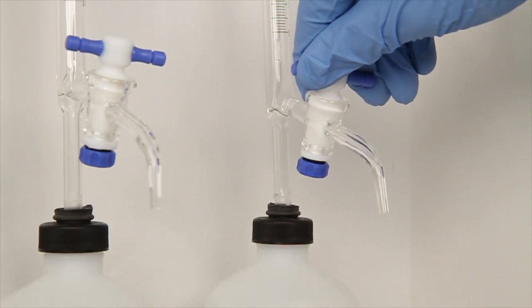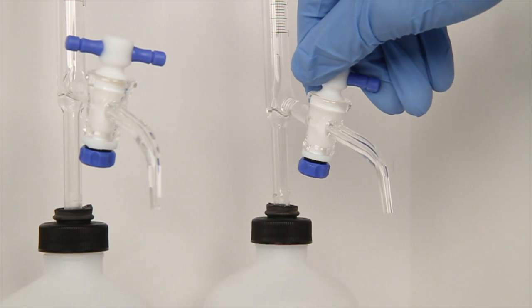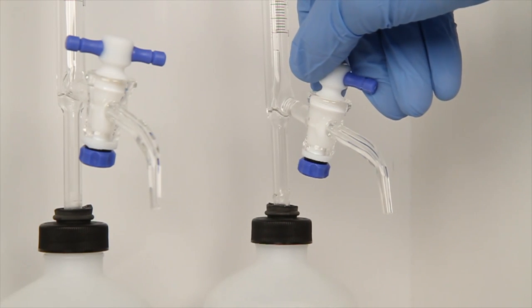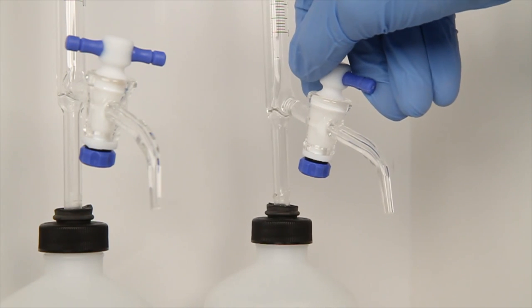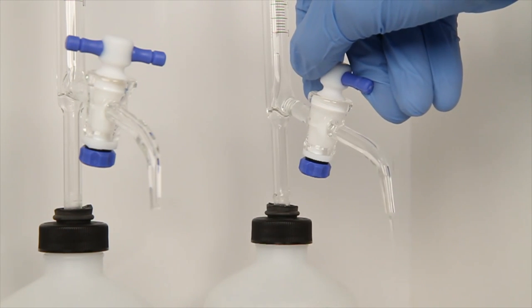The next step is to titrate the sample with the EDTA titrant using the burette. Turn the stopcock to add the titrant to your sample. Make sure you are mixing the sample while you add the titrant.